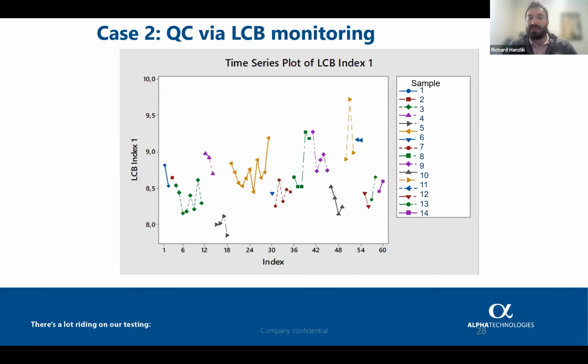If you're injection molding, extruding, whatever you're trying to do, that's all going to change. Temperatures, flow rates, shear rates, those all will have an effect on your processing. This is just a tool to give you some insights into your materials, so you can optimize them. Yeah, exactly, that makes sense. Another tool in your arsenal, along with the other things you mentioned at the beginning of the presentation.